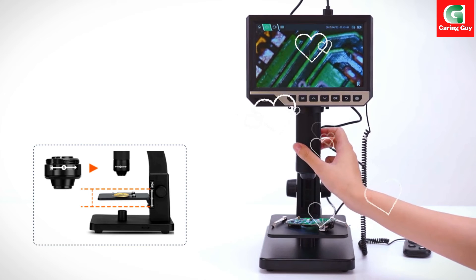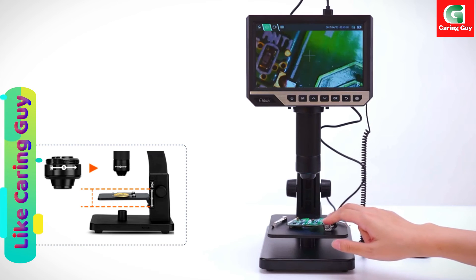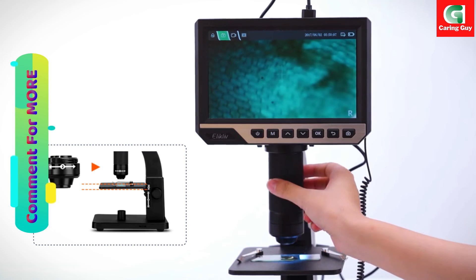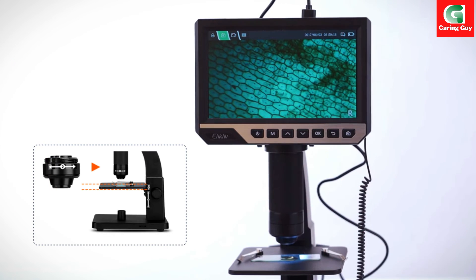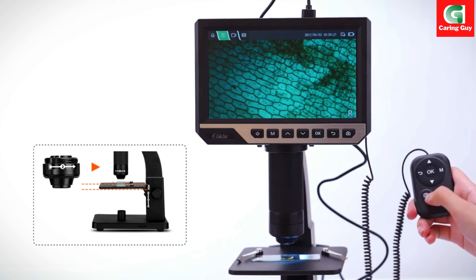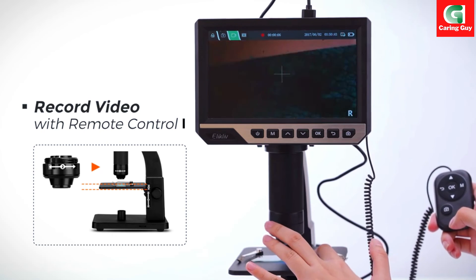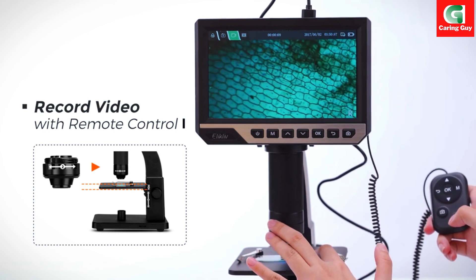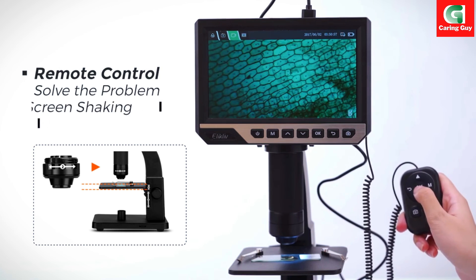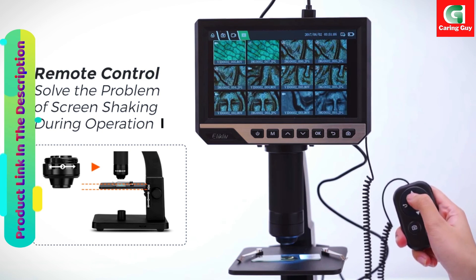In conclusion, the Elicliff EDM11S 2000X biological digital microscope excels in providing a comprehensive and versatile solution for microscopy needs. With its dual lenses, remote control, large IPS LCD screen, and adjustable features, it ensures a seamless and efficient workflow for users across various fields of study and professions. Whether exploring macroscopic objects or delving into the microscopic world, the EDM11S delivers an exceptional and user-friendly experience.